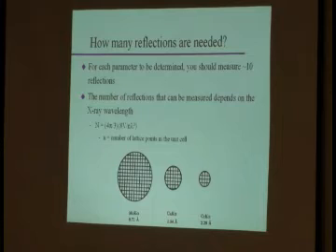This kind of just gives you the face-on view. Of course, this is three-dimensional space that you measure, right? So it makes a big difference. This also shows you why most small molecule crystallographers will be measuring with molybdenum, okay? You see a lot more reflections.